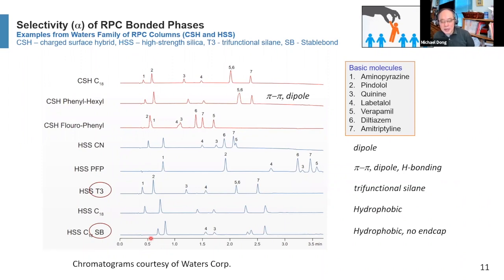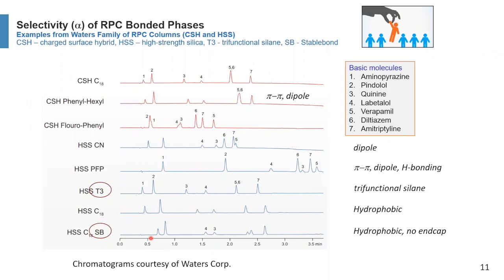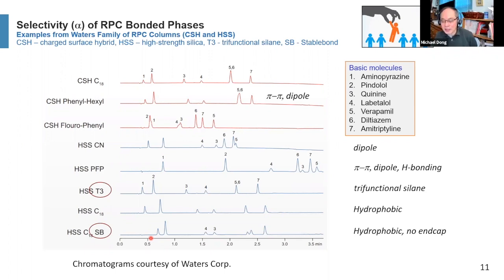So most C18 are very similar, but they do have small differences. There are thousands of C18 columns. If you have just one peak using a C18 column, then it doesn't matter. You can use all kinds of C18, it will work for you. However, if you have a very complex separation, then you actually have to specify the part number for the C18. They are not the same. There are differences in bonding density, residual silanol activity, and things like that. So all C18 are not the same. Definitely you have to specify the part number of the column in order for it to be reproducible.